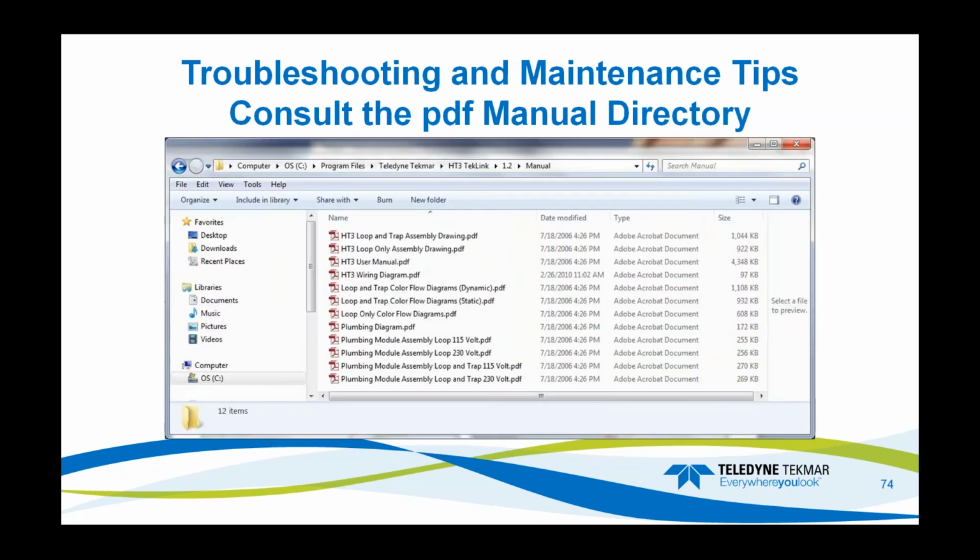With the HT3, similarly, under the manuals directory, we include quite a few manuals. We have assembly drawings. We have the user manual available. We also have the wiring diagram. Again, these will also have part numbers in them for you. We have the flow diagrams that show you during the different steps of the instrument what the flow is doing. Plumbing diagrams, and even the plumbing module assemblies, which again have the part numbers with them.